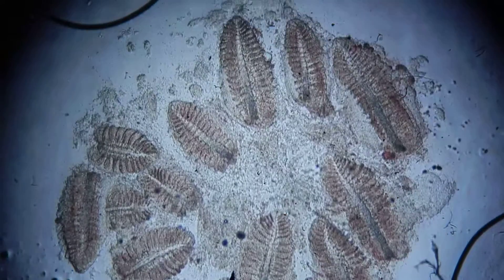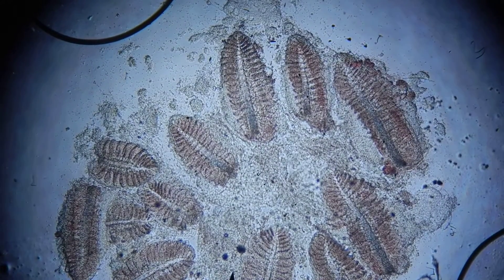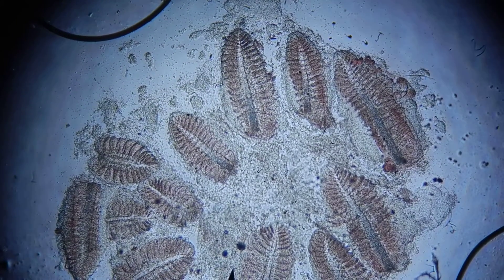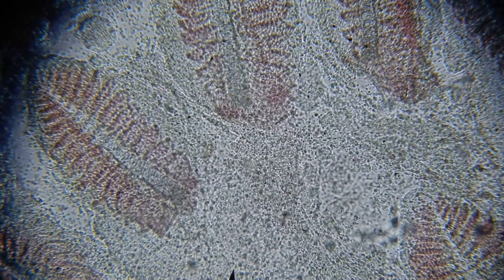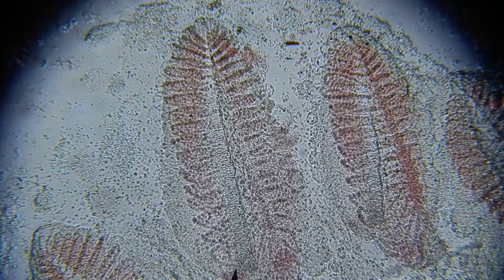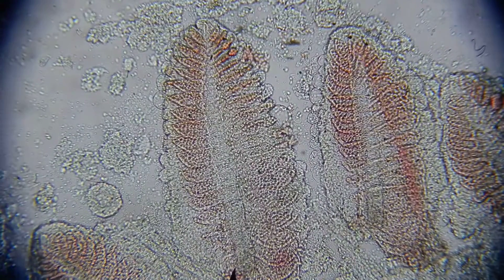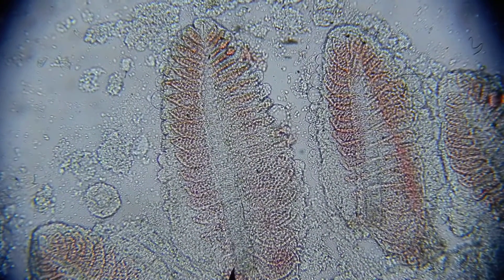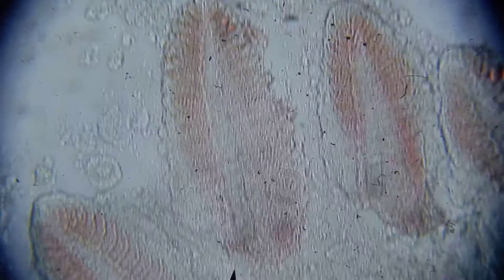So in this gill biopsy, I've actually taken a few more than I normally would, just so that you can actually see the differences or what normal would look like in various different gill filaments. So what we can see here, the gill filaments, might go down to a lower power. And you notice it looks a bit like a Christmas tree in appearance.